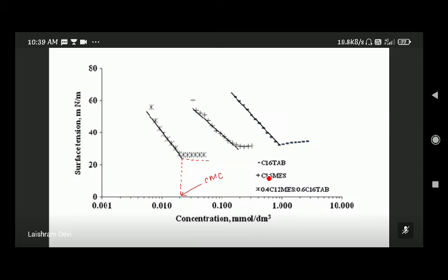Firstly, we measure the density of the liquid, all the solution which will be provided to us. Density इसमें measure नहीं करेंगे. You will be provided with very dilute solution, so I don't think इसमें density measure करेंगे. एक बार मुझे ना सेम रहेगी लगभग. एक सेकेंड रुक जाओ. Let me check the file which I have. I think इसमें we don't let the student measure the density because it is a huge task.